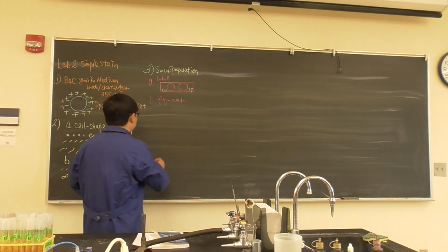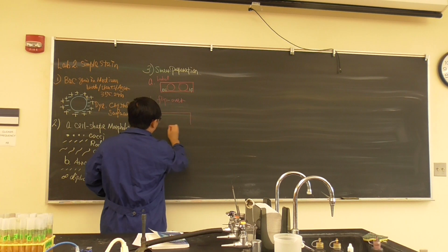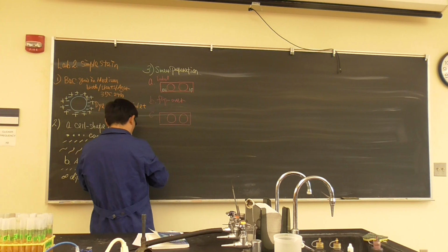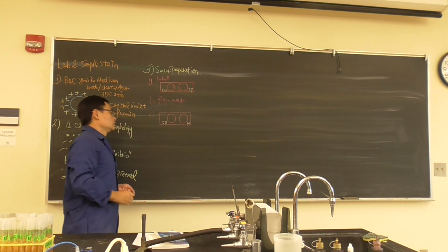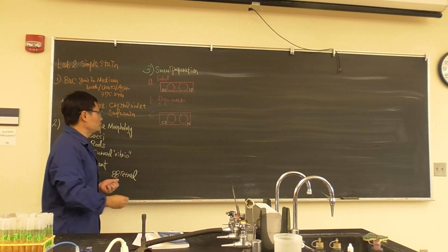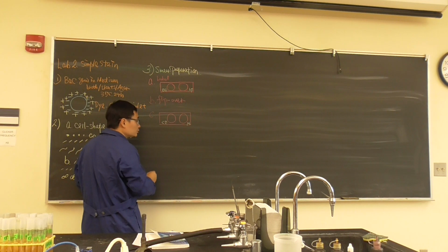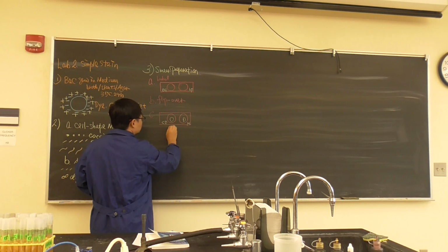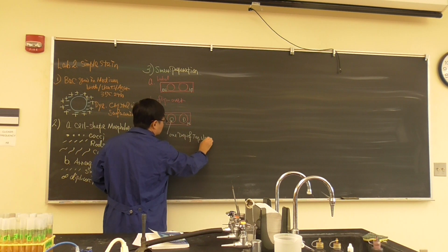Okay, when you flip it over, what are we going to do? Let's draw here. We just draw this one. You flip it over, two circles, so it becomes EC and LF like that. Okay, when we flip it over, now what we do, we're going to put a bacteria there. But before that, we need to make a smear, therefore we need to add one drop of liquid. That is one drop of just tap water. Okay, I'll show you how to do it.